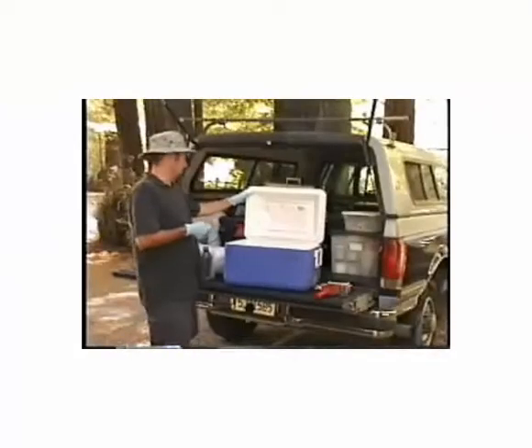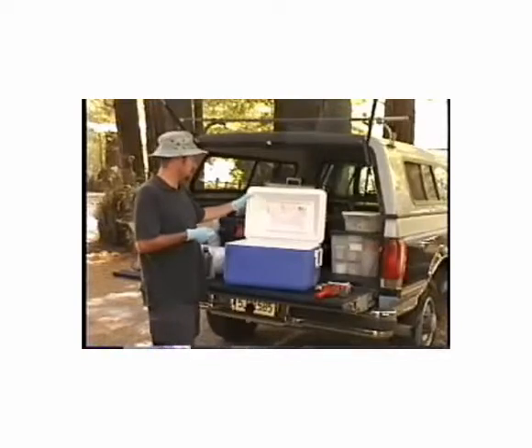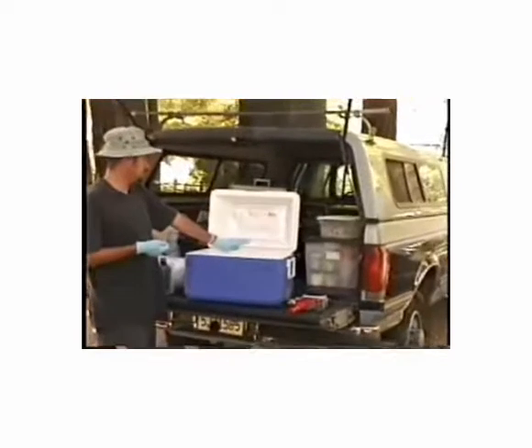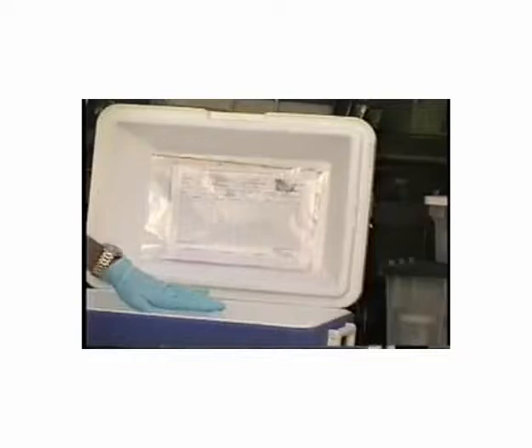When preparing a cooler for shipping, there are many details you want to follow to make sure that the samples are safe and not broken and get to the laboratory on time. First of all, we fill out a chain of custody form to log all of the samples that we collected, the date that they were collected, and the time that they were collected. Usually we like to record the salinity of each sample just so the laboratory can know. And we put the COC in a plastic bag and tape it to the roof so it does not interfere with any of the ice or any of the water in the cooler, so the laboratory can read it properly.